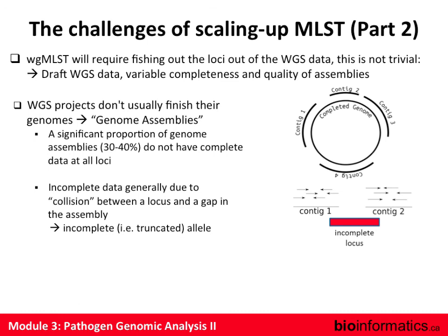And so the problem with that, of course, is that we can't tell whether the gene is missing because it's in a gap or because the strain doesn't carry that gene. So how do you know? You can't know. That's the problem.